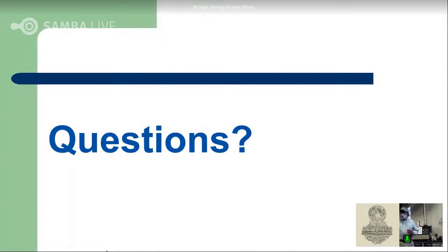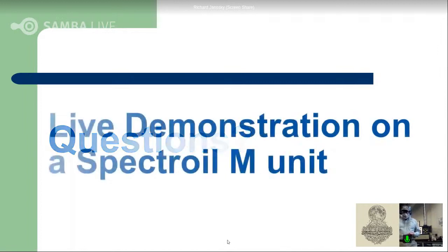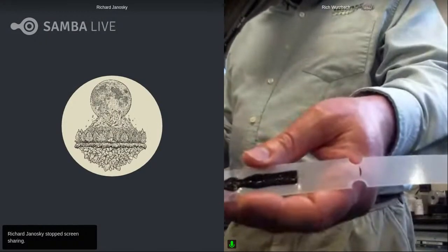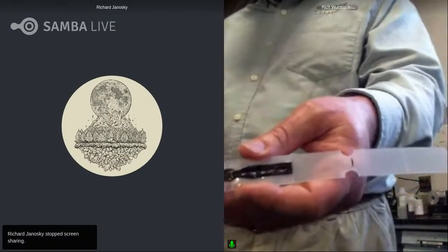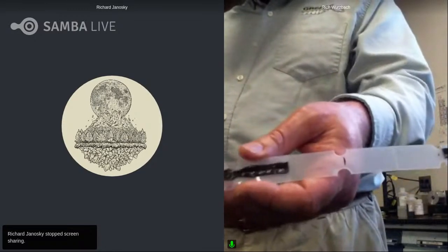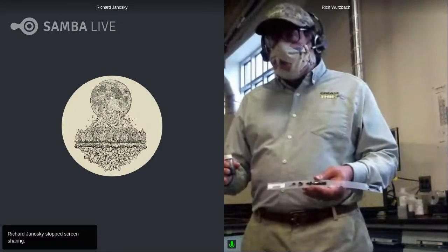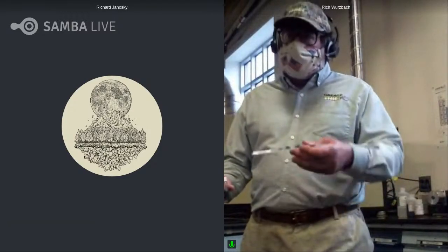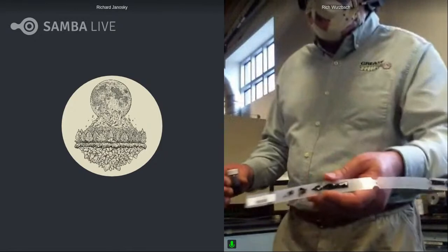Before I turn this over to Lisa, to show us her company's equipment, the Spectro RDE, I want to talk a little bit about how we get to that point from the grease itself. If you're just starting with a glob of grease, it can be tricky, especially the solvent selection process and how effective it is. What I'm showing here is what I had up a moment ago, which is our substrate, coming from the grease thief analyzer. Those of you who were in our sessions a couple weeks ago saw us using the grease thief analyzer, doing particle counting with the grease that was set down on the substrate.